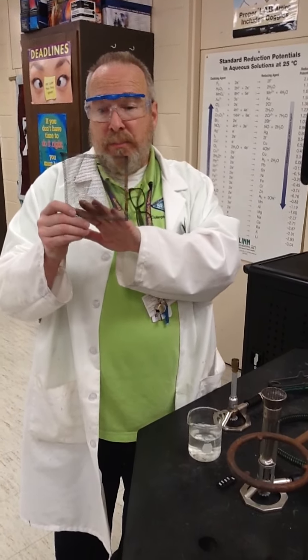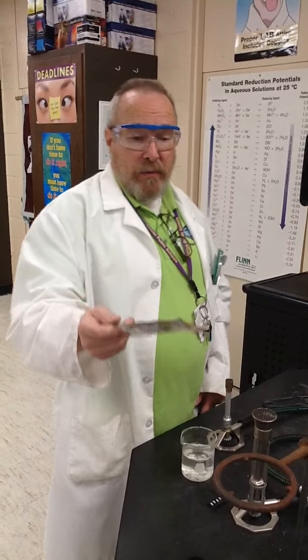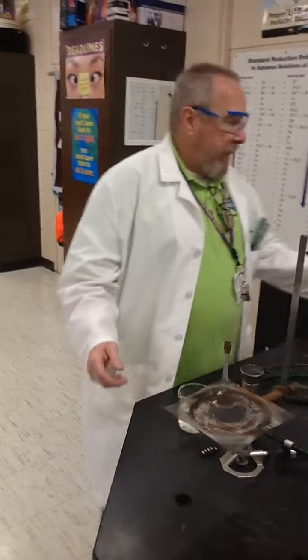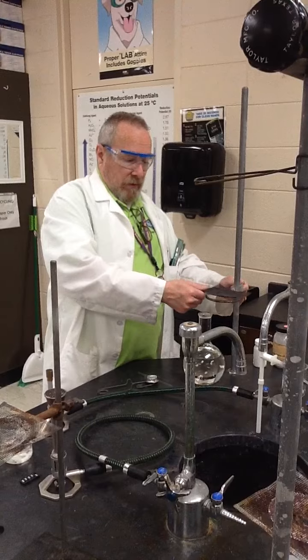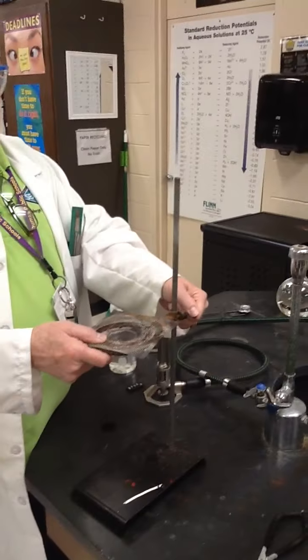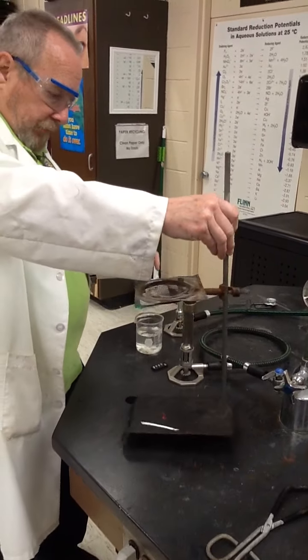The modern ones are impregnated with ceramic. This is just a plain wire gauze that hits that heat and spreads it out so it heats the bottom of the beaker evenly. I have built-in stands, and I have rings on them, or I have what's called a ring stand with a ring on it. This one's a little more flexible because I can move it to any position on my bench.